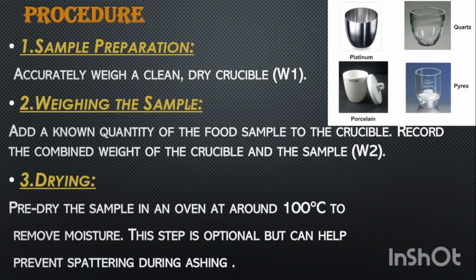What is obtained after complete combustion of a sample is the total ash. It comprises 2 portions. The portion that is soluble in dilute acids contains all essential minerals and that is the useful portion of the ash. The other portion, which is insoluble in the dilute acid, consists mainly of sand and silica. For the most part, it represents impurity or adulteration.